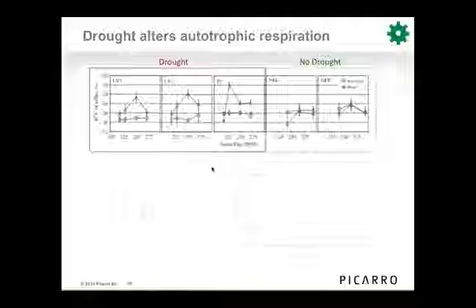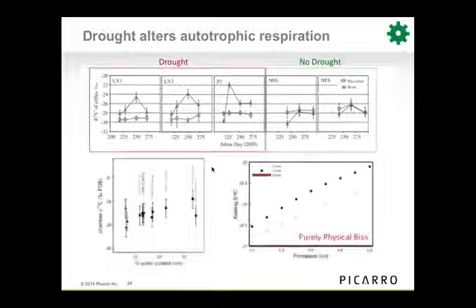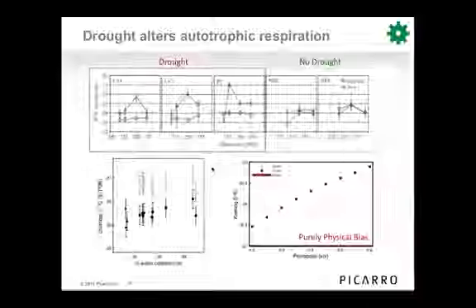But we wanted to follow up on that study a little bit and see if we could reproduce the same results in the lab. These are some data from Claire Phillips, who was at Oregon State at the time, and she was looking at Douglas fir seedling plots. These were experimental plots where she had a piece of PVC with either a Douglas fir planted in soil or not planted in soil. So the other treatment was just a soil column.